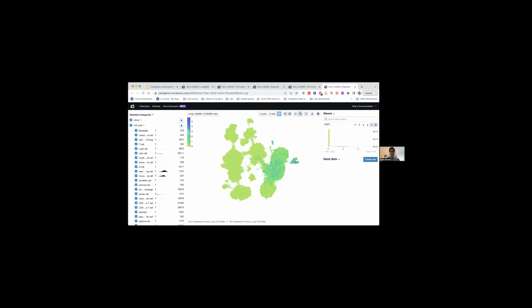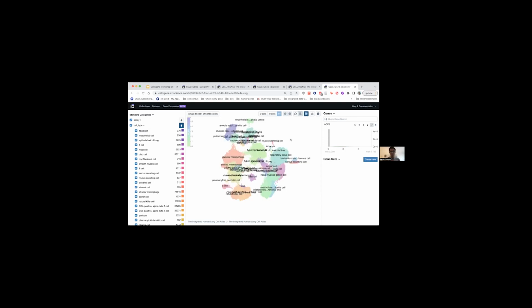And finally, the last piece of information that I wanted to share with you is one of the most important aspects of this tool, which is performing differential gene expression using the UMAP. Here, I'm going to pick the lasso tool. I'm going to click and drag. It might be hard to see, but I'm creating a circle with the lasso tool, and then I'm dropping. I just selected a few respiratory basal cells.